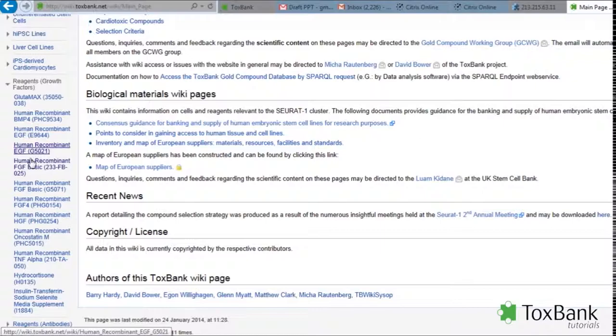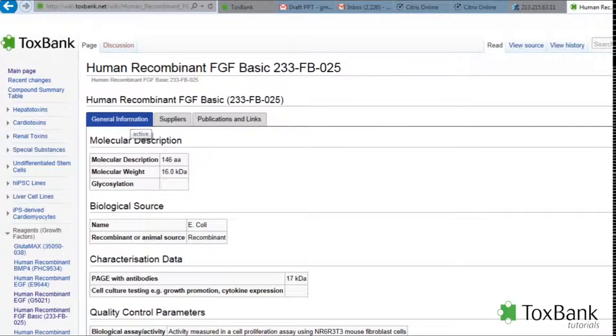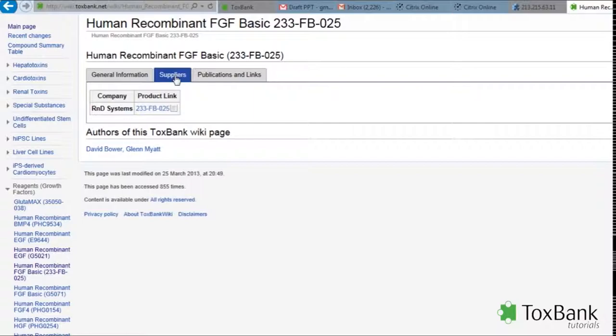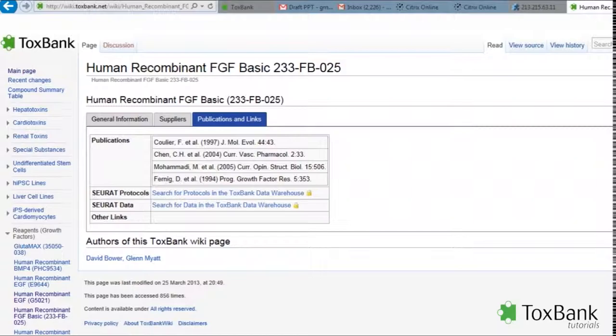These are supply-specific reagents. Clicking on any one of the reagents will then bring up more details on that reagent. This would include some general information about the reagent. It will include information on the suppliers and also a link to the specific supplier where you can get that particular reagent, as well as publications and links.